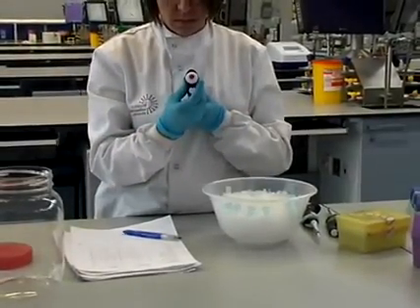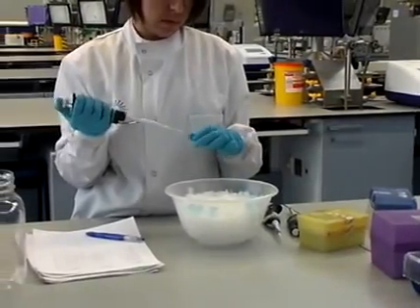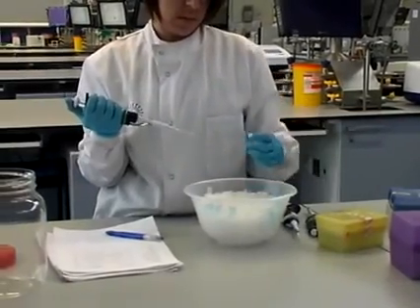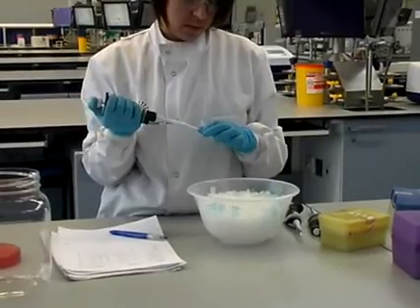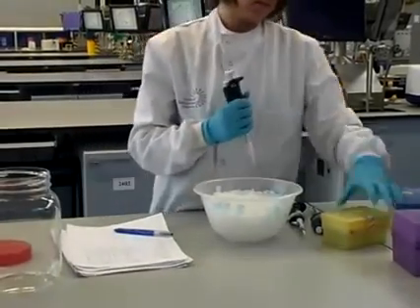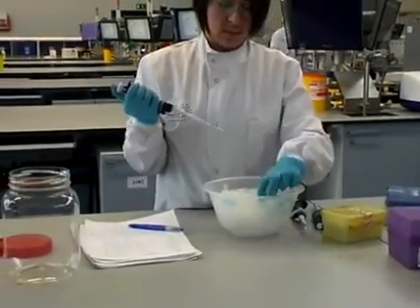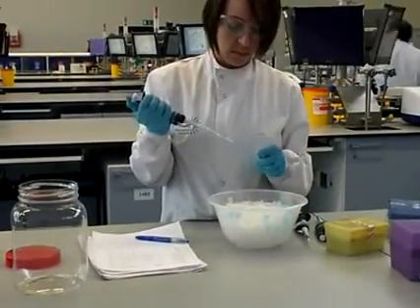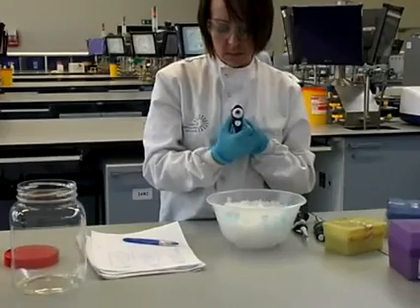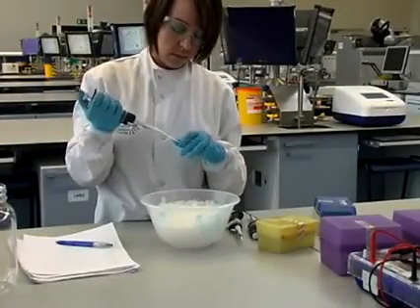Each volume of reagent is recorded on your worksheet and the pipette is adjusted to get the correct volume to add to your working master reagent. The next reagent is the forward primer — a piece of DNA which corresponds to the piece of DNA you're actually looking for. The next reagent is the reverse primer, which is added to your master mix. All reagents are kept on ice. The next reagents to add are the deoxynucleotide triphosphates, which are the bases used by the enzyme to synthesize the new DNA in the amplification process.